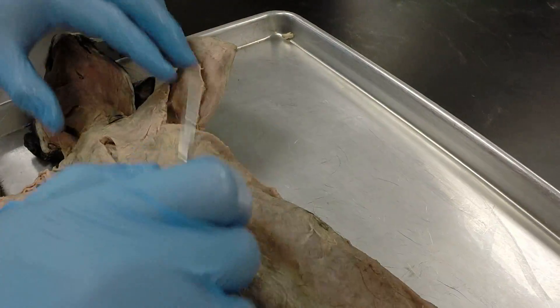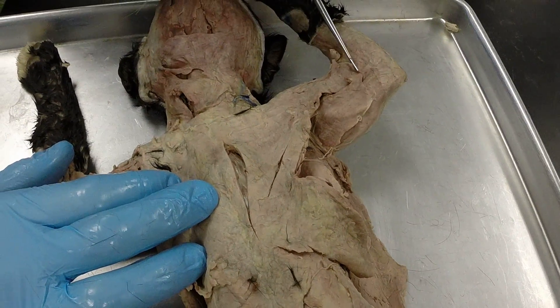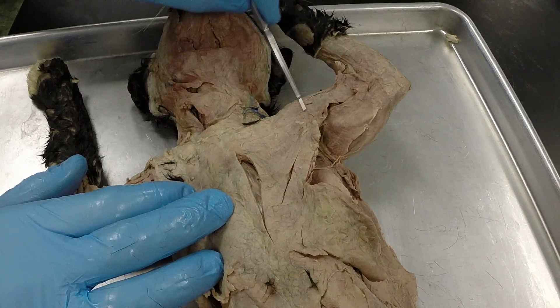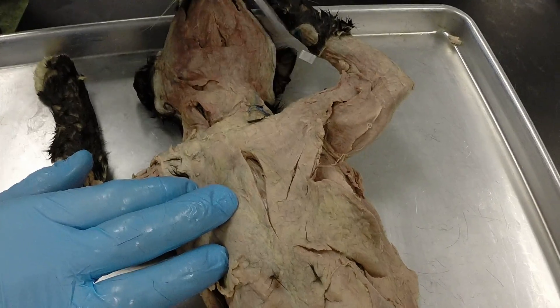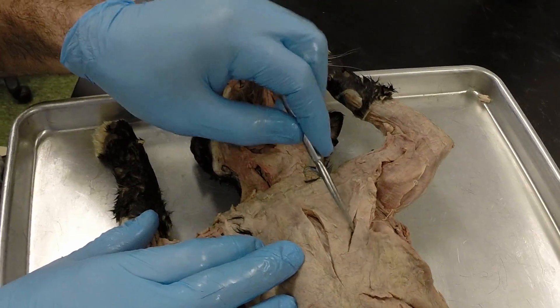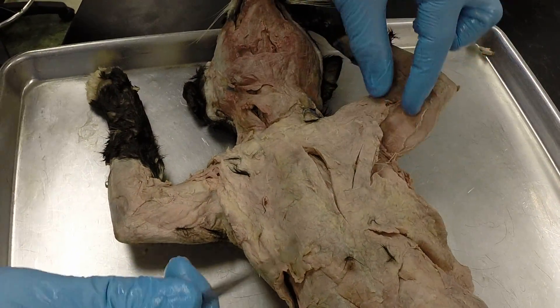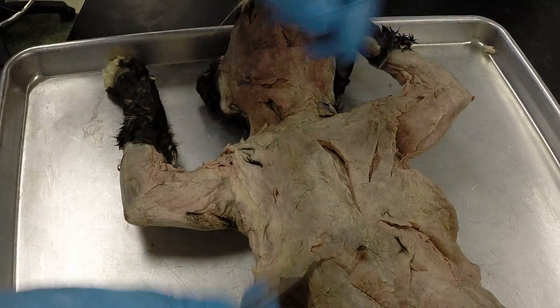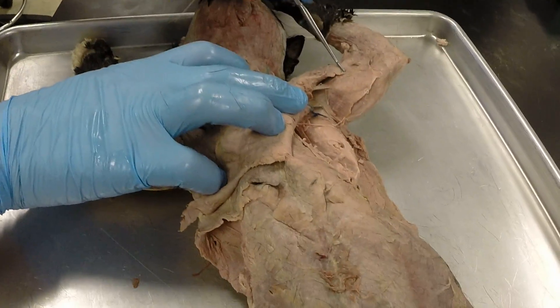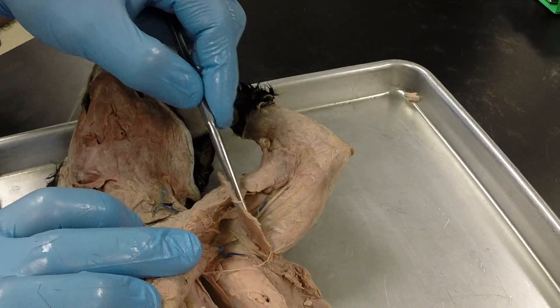Looking at the chest, we have a muscle that goes from the arm near the elbow area all the way across the chest — this is the pectoantebrachialis muscle. Then we have the pectoralis major, the pectoralis minor, and the xiphihumeralis running along here, though on this cat it's kind of broken off. Going deeper, we can see a thin superficial muscle on the medial side of the arm — this is the epitrochlearis.